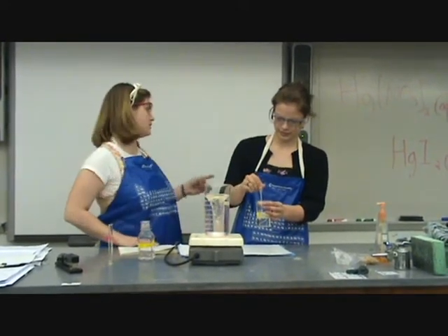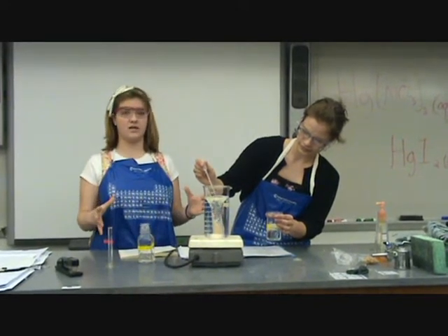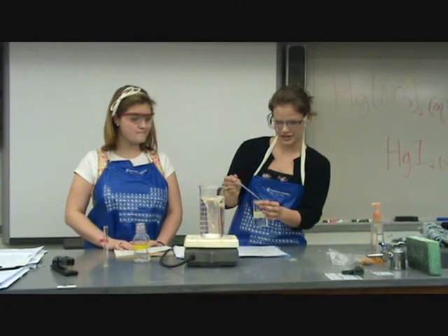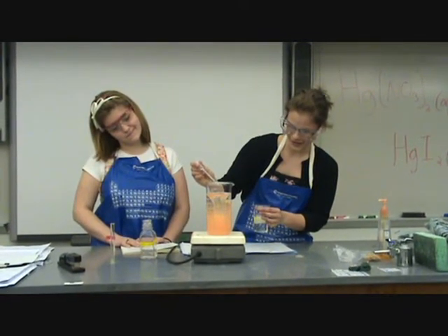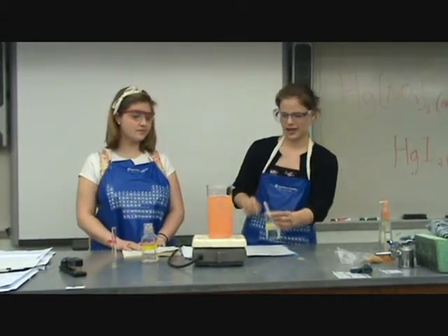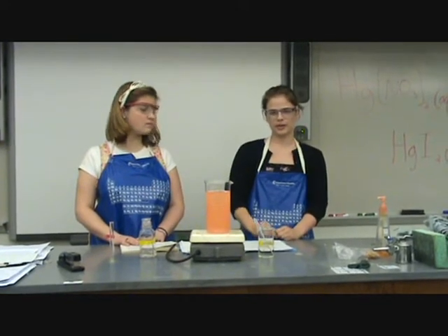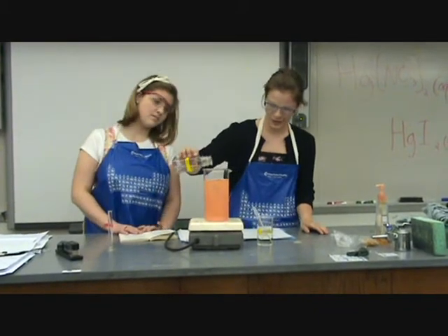But as the reaction proceeds, the color disperses and it's invisible. And although there is still some HgI2 there, you can't see it because the concentration is less and it has reached equilibrium. And we can even supersaturate it, which I'll try to do lightly. Ooh, getting some yellow. And this is when the HgI2 is completely in higher concentration than the reactants. And to go back, we just add more mercuric nitrate.